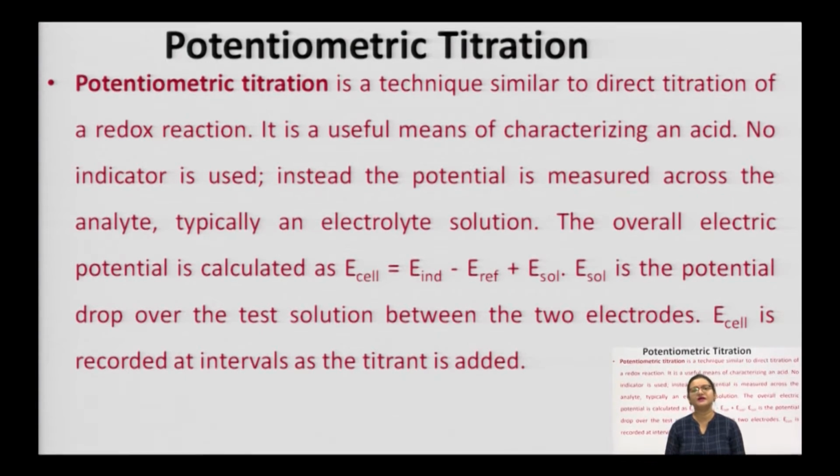The endpoint simply commences with a drastic and sudden change in potential difference which comes along with the titration as the endpoint shows in the titration, which can be measured easily with the potentiometer. Okay. Potentiometer shows the fluctuation in the potential or voltage difference along the analytical solution in which it is being dipped.